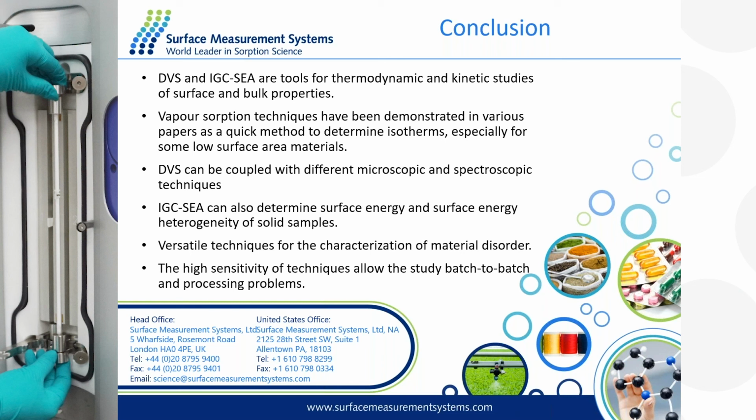The lowest limitation for IGC could be that it can measure 0.1 square meter per gram, still with quite good reproducibility. For example, for some high-aspect fibers, it has 0.1 or 0.2 square meter per gram. I'm not quite sure about the comparison with krypton sorption, because normally we just use nitrogen sorption. Sorry.